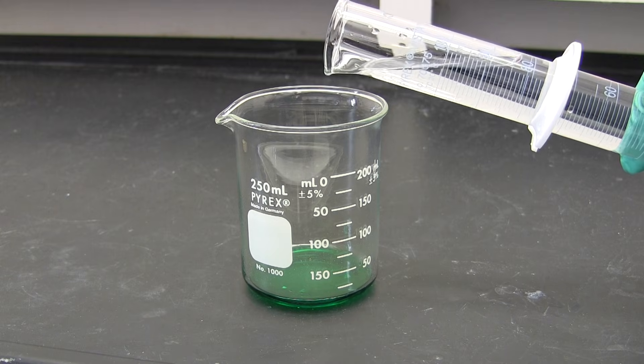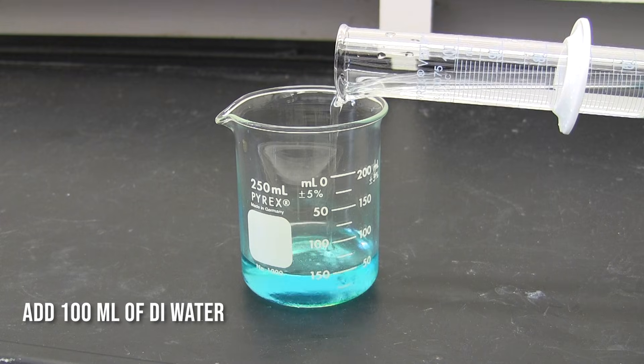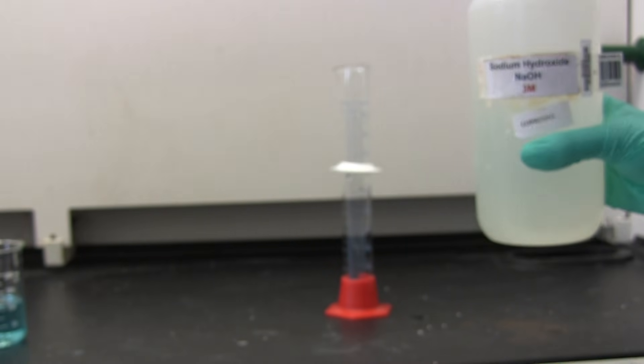Next, we are going to add 100 ml of deionized water to the reaction beaker, and we get this really pretty blue mixture.